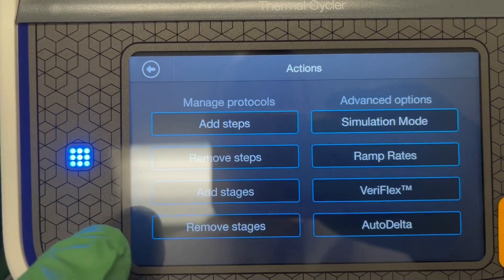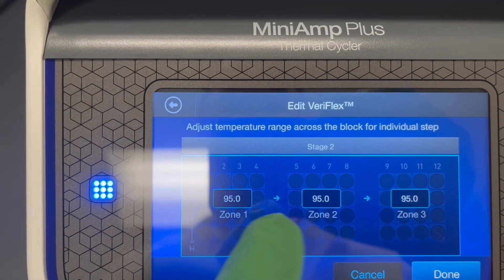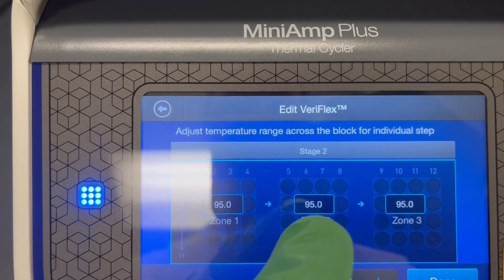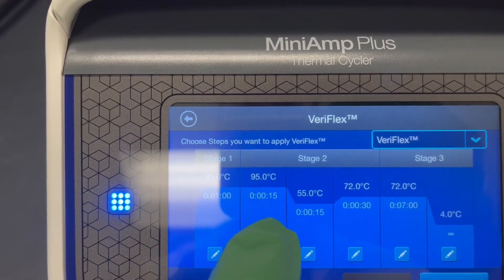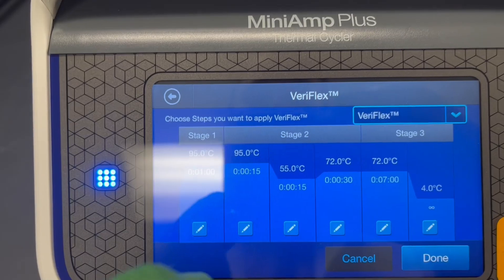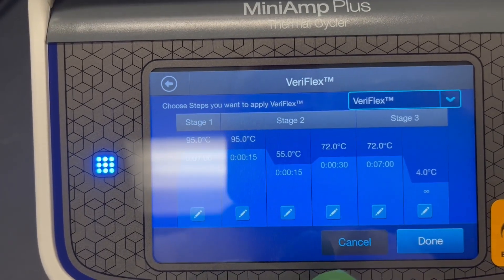Not everyone will need to use this, but if you wanted to use those blocks independently you can hit Veriflex. Let's say we wanted to do it on this step — this protocol has the step set to 95°C across the entire plate. If we were doing a gradient, we could select one of these blocks and change the temperature, perhaps setting zone two to a different temperature, so we have three separate temperatures. Hit Done, and it will show a little indicator showing that that step is using Veriflex with different temperatures on each independent block. That will happen every time the stage repeats and that step is run.